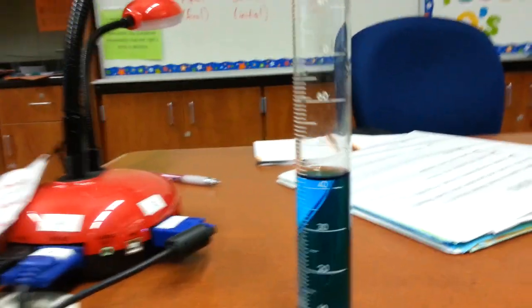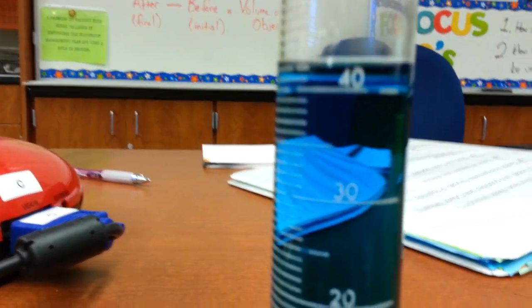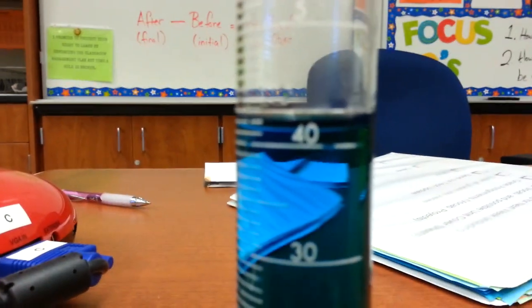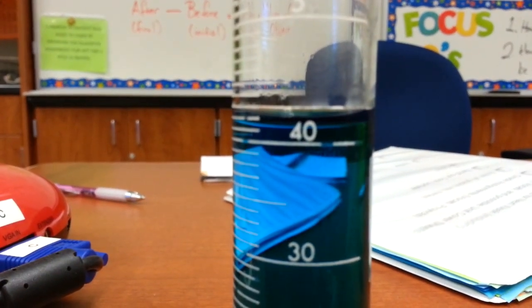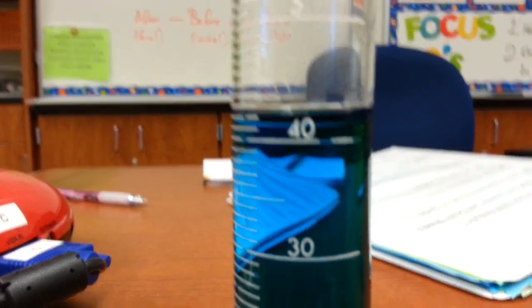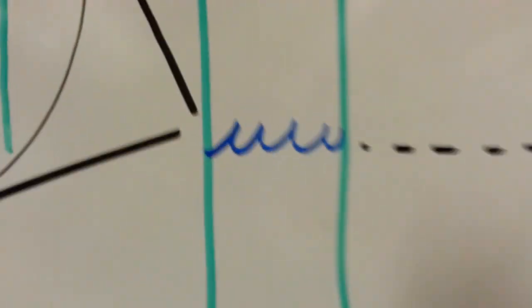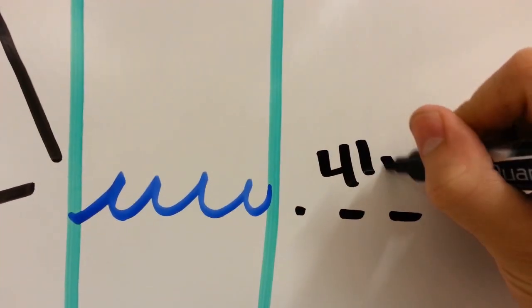So in a graduated cylinder, the volume is measured in milliliters. I can see here, if I look at the meniscus, it's about 41 milliliters. So I'm going to go ahead and write 41 milliliters right here.